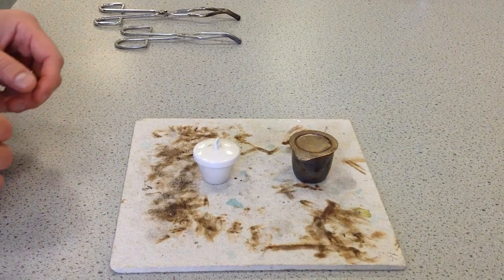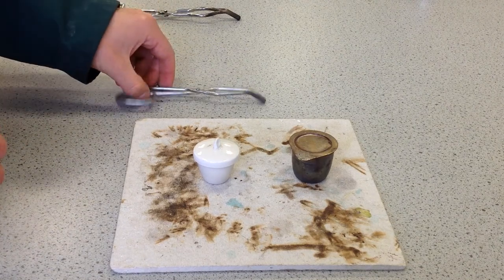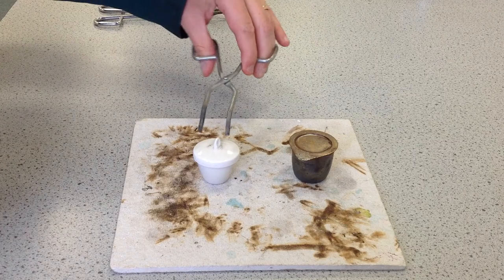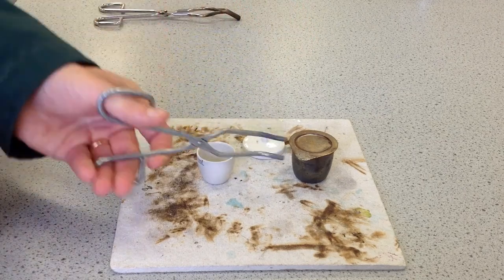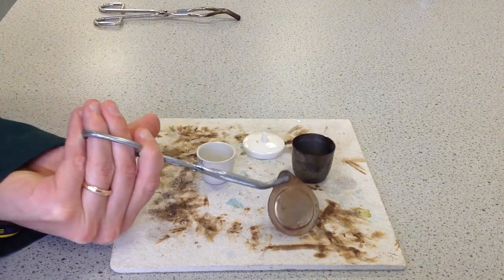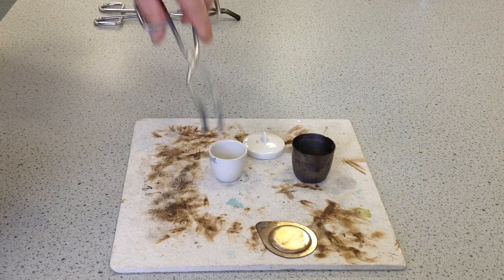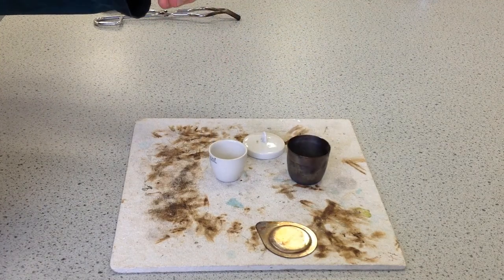The right tool to hold a crucible is called crucible tongs, and there are two examples here. I'll show you the simple type first. These are just shaped like a bird's beak — you open them up and put them around. You can pick off lids like so, and if you're concerned there's something on the bottom of the lid, you can twist it around. You can grab the side of the crucible like so. They're the right type of tools to use.